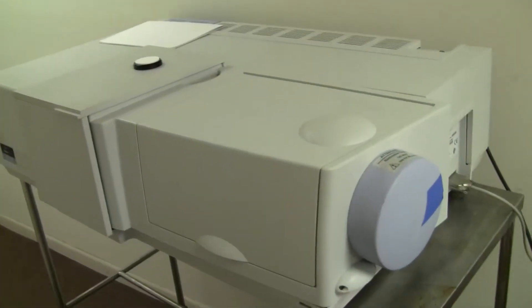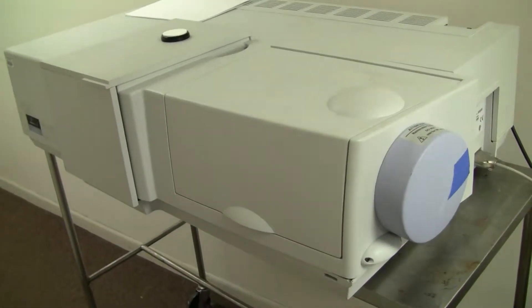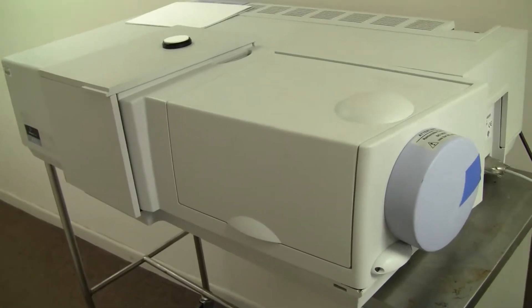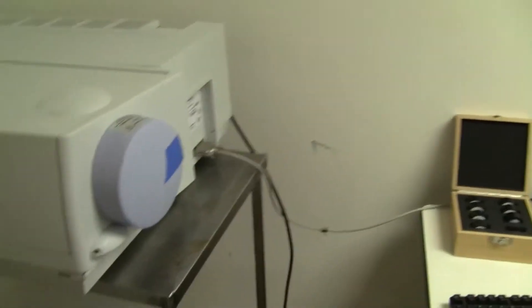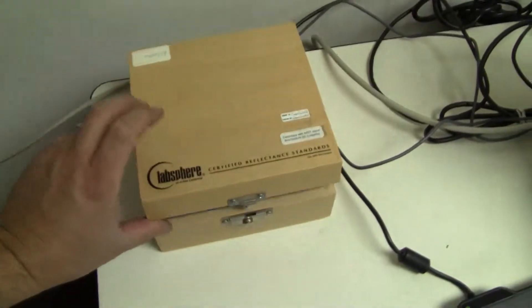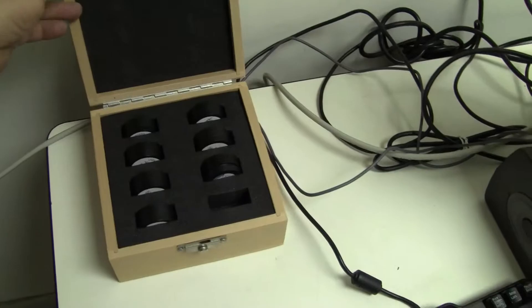Hi, this is Michael from HitechTrader and today we're looking at a Perkin Elmer Lambda 800 with an integrating sphere. We ran three reflection standards.